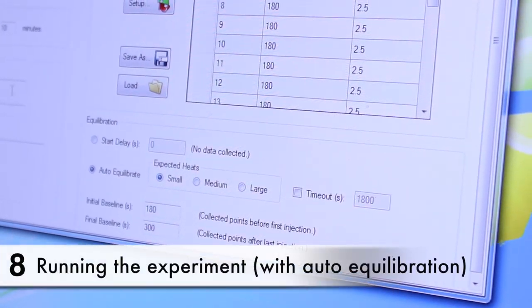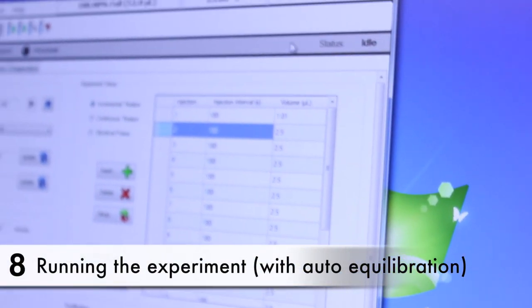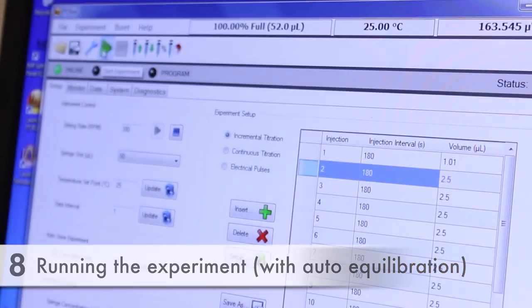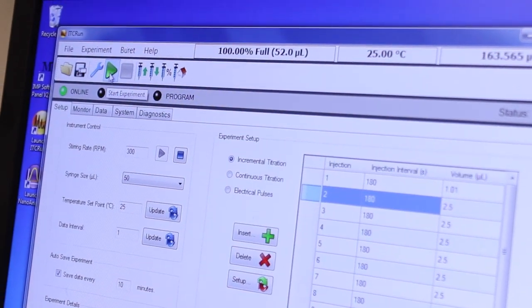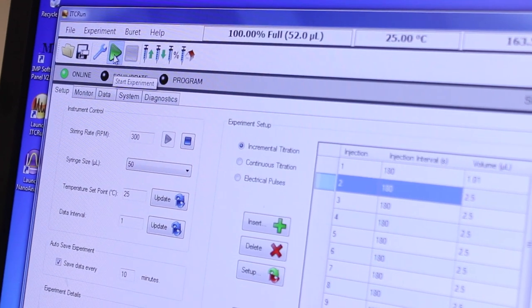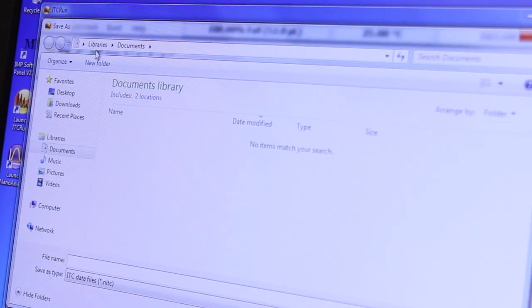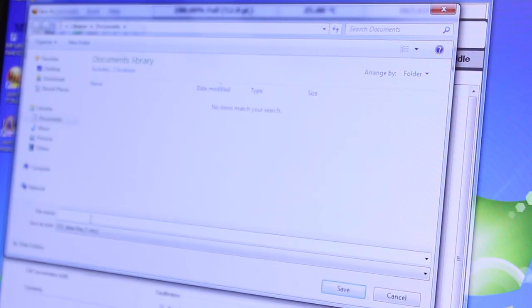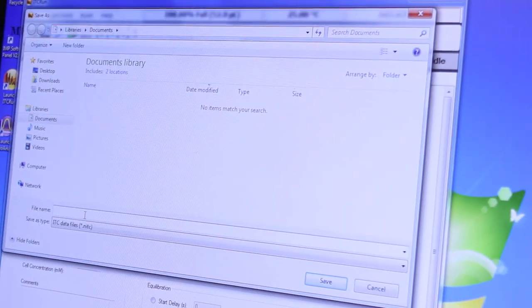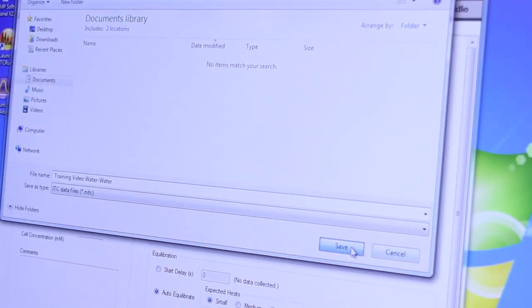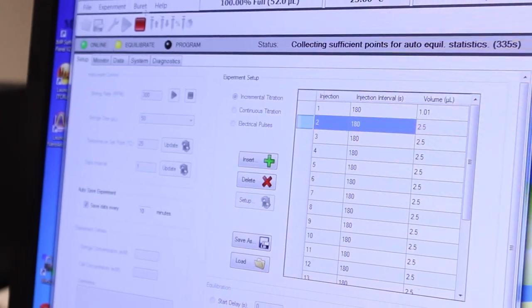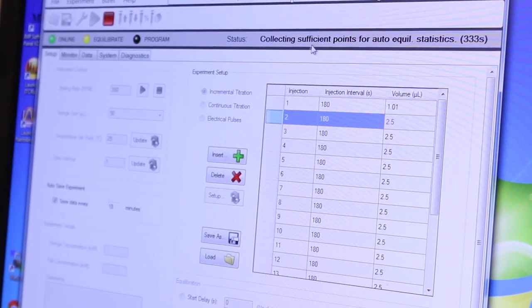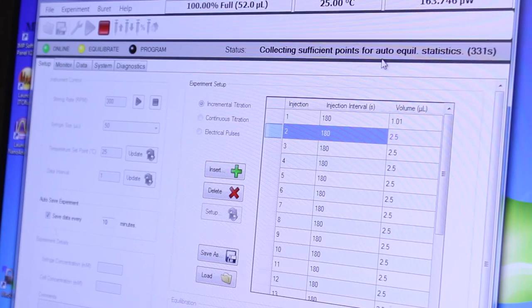So now everything is ready we can start the experiment by clicking on the green triangle here that says start experiment. It will prompt you for a name of a file if you haven't entered one already.